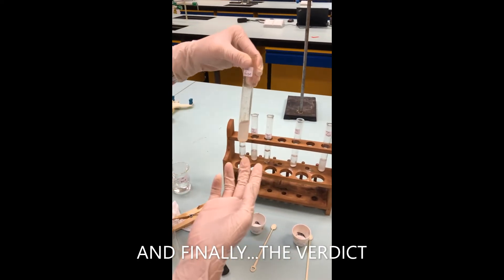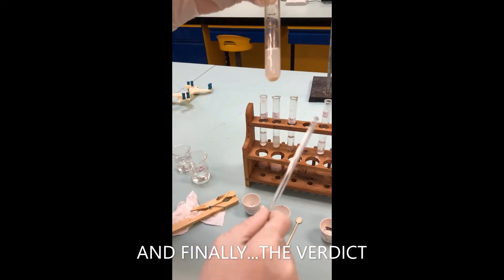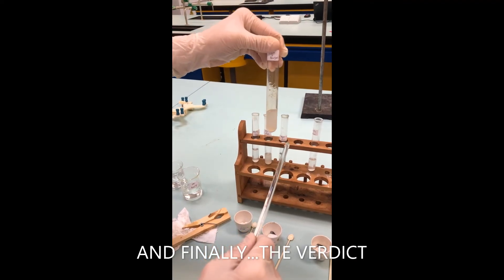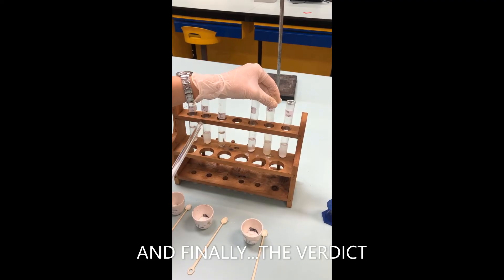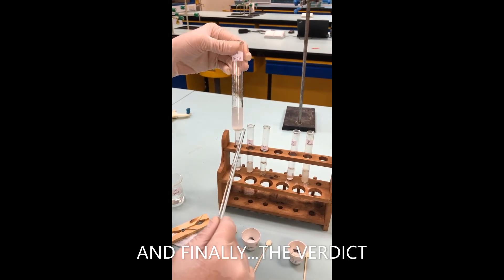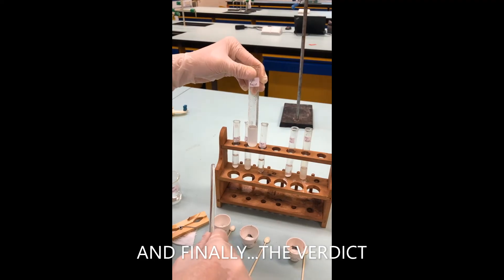Silicon dioxide and sodium hydroxide — it dissolved a little bit. You can see some solid is left, but some of it has reacted; the solution is not very clear. Nonetheless, there is still a reaction. Lastly, magnesium oxide and sodium hydroxide — whatever we put in is entirely still here, and the solution is very murky, so no reaction for this one.